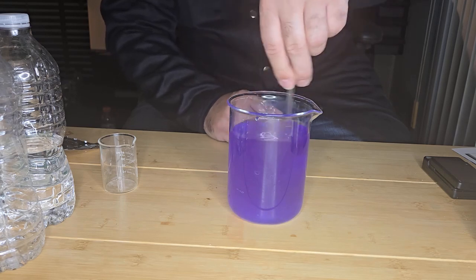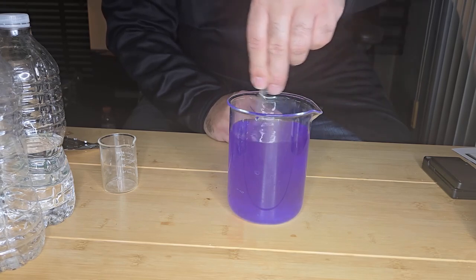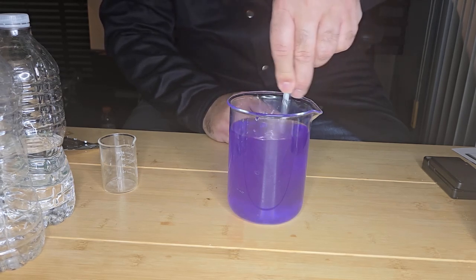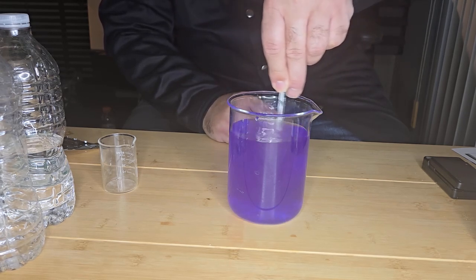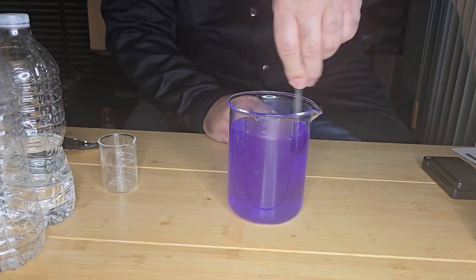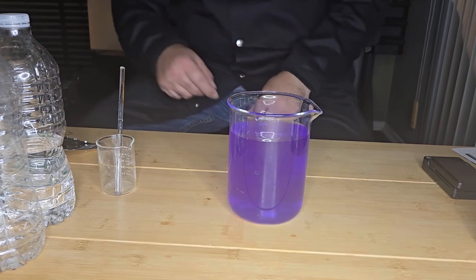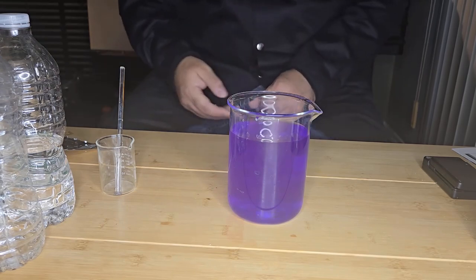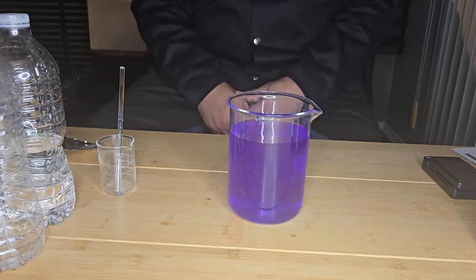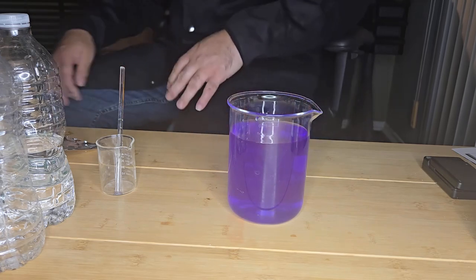I want this totally dissolved. So I'm going to turn off the lights. Again, I'm going to turn off all of the lights, and then I'm going to put a direct light source to the beaker.